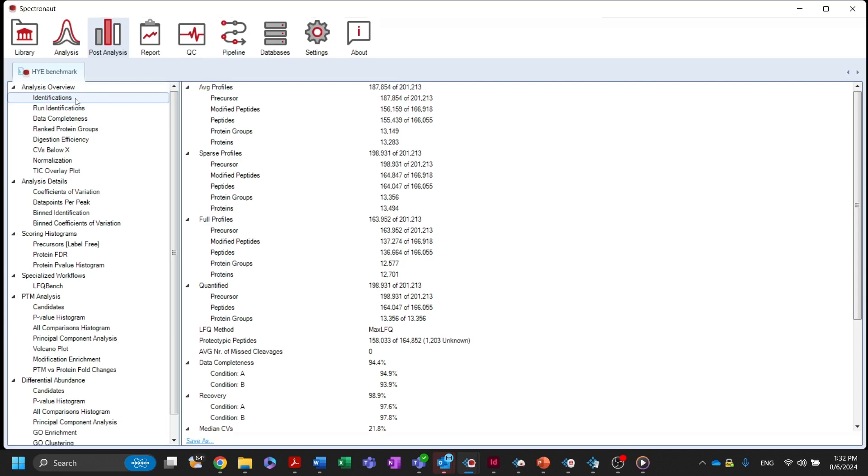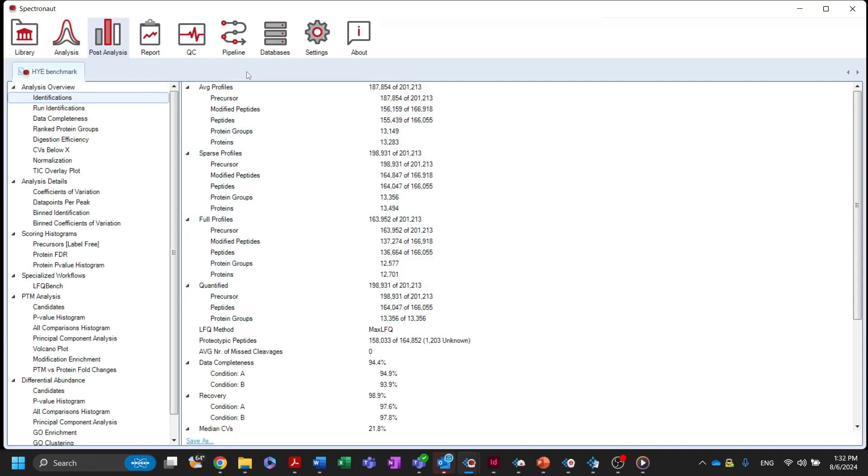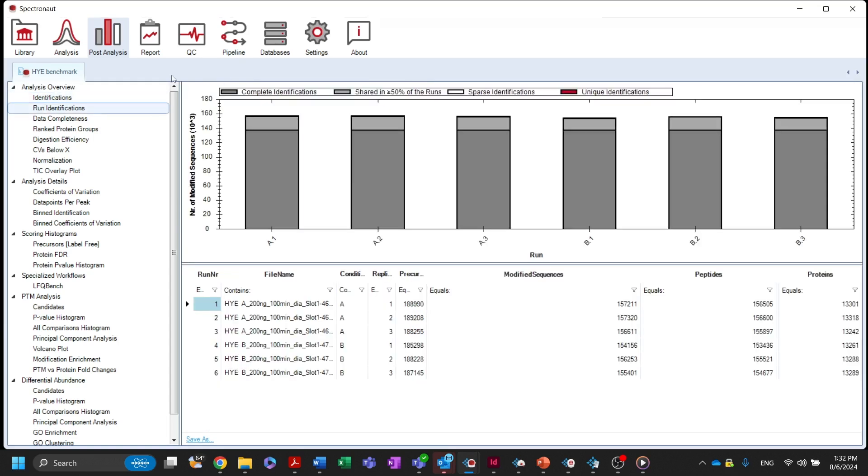The identification node shows a summary of the number of precursors, peptides, and proteins that were identified and quantified, along with other general metrics about the experimental outcome. Similar information is available in graphical form in ranked identifications.